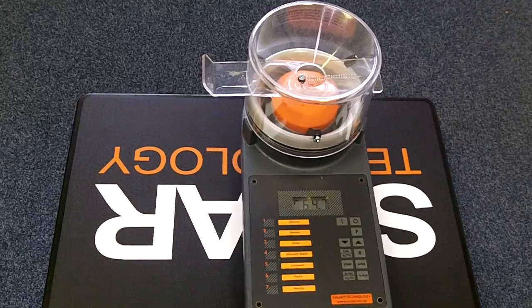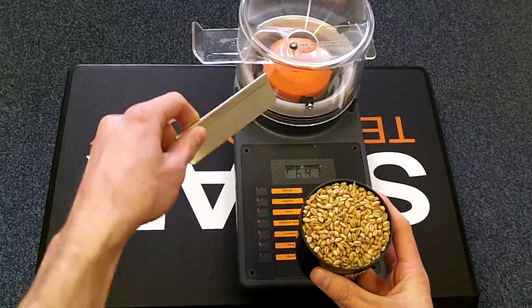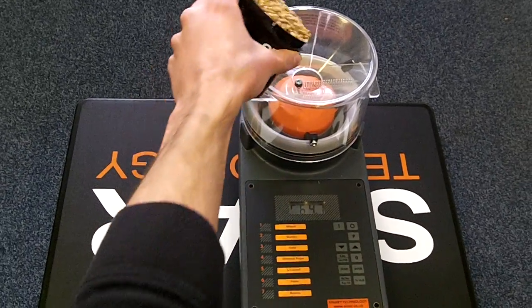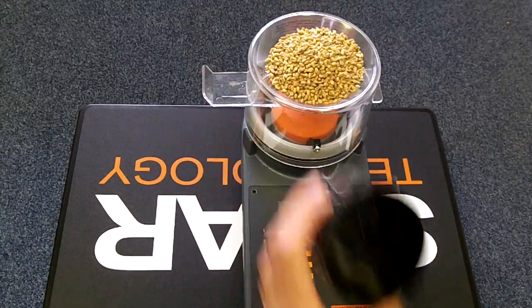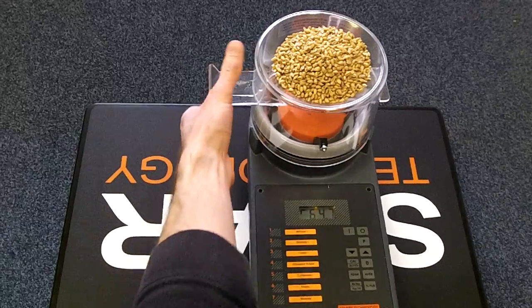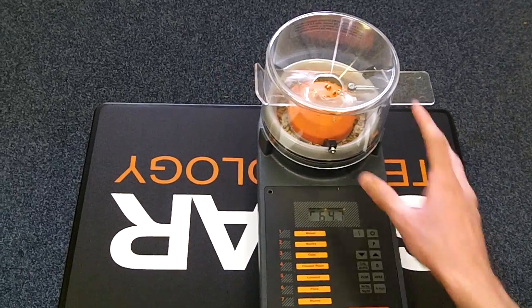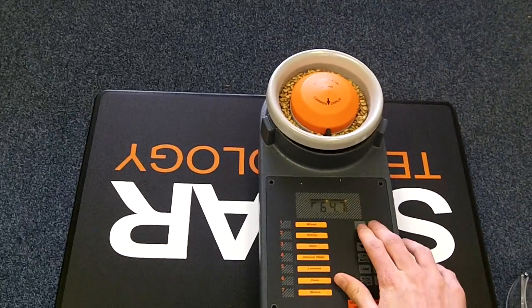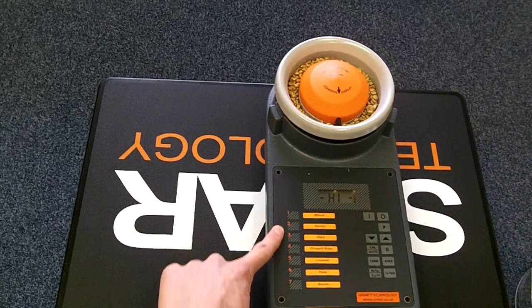Take the measuring beaker and fill it with your sample, and then strike it off with the strike-off blade to get a nice level fill. Pour the sample into the hopper and push up gently on the slide to release the sample into the instrument. Remove the hopper, switch the instrument on and choose your crop from the list on the left.